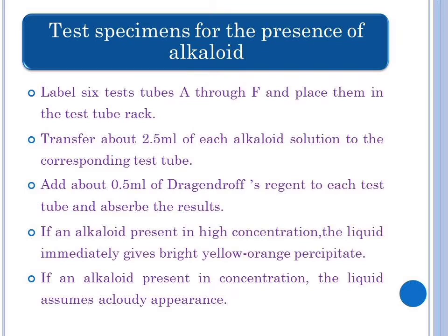Then spot a chromatography strip with a mixture of alkaloids. Develop and visualize the chromatogram and determine the Rf values for each alkaloid present in the mixture.